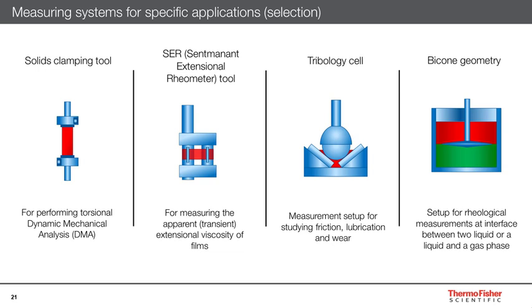The illustration next to it represents a tribology measuring cell for rotational rheometers. Tribology is the study of friction, lubrication and wear, and with this setup such tests can be performed also with a rotational rheometer.